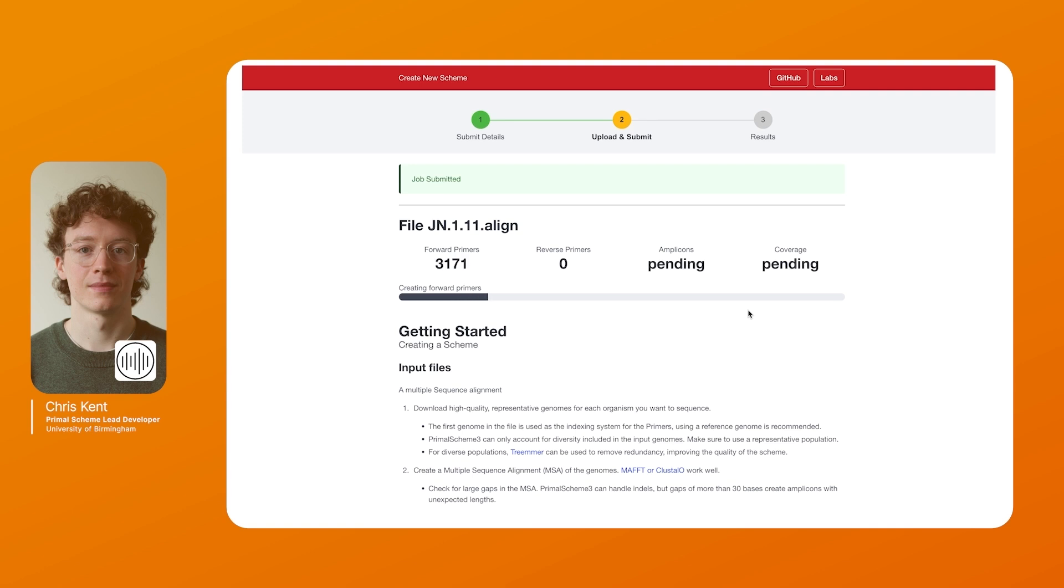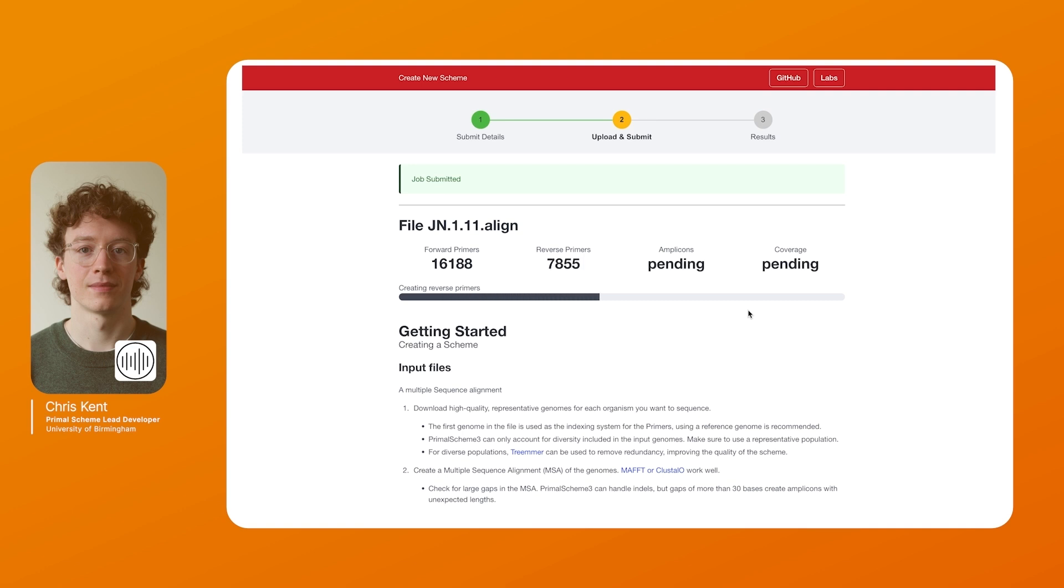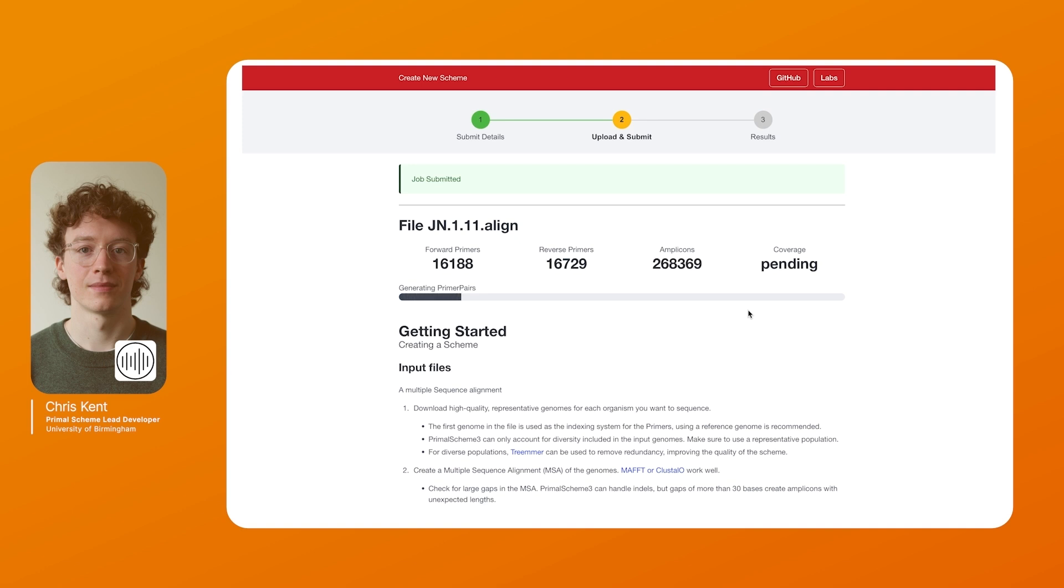So at each step in the genome here it will calculate what position can be used as a forward primer. It will then calculate what positions can be used as a reverse primer and it will combine all of these to work out what amplicons meet the criteria that we need. I'm looking forward to seeing how people use this tooling to create new primer schemes to sequence new and uncharacterised viruses.